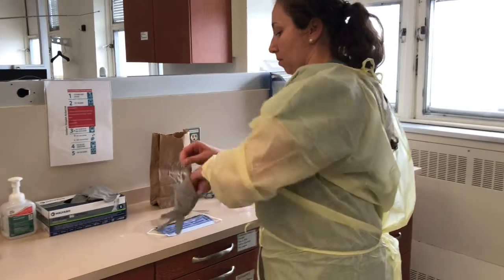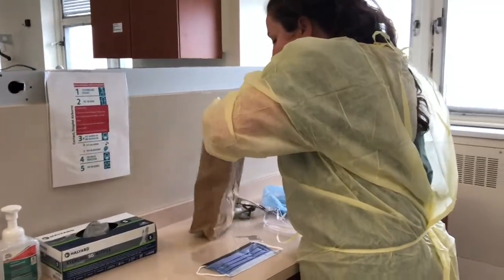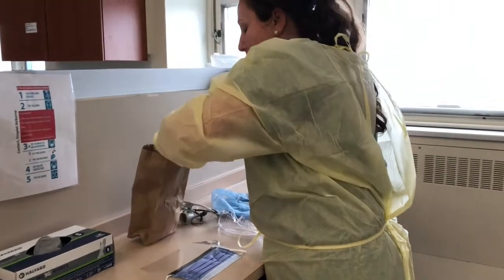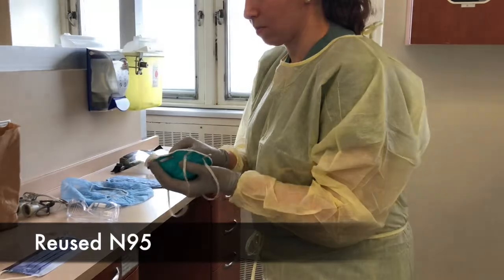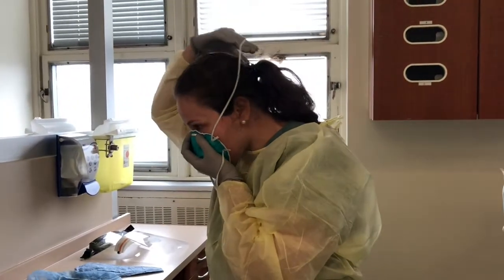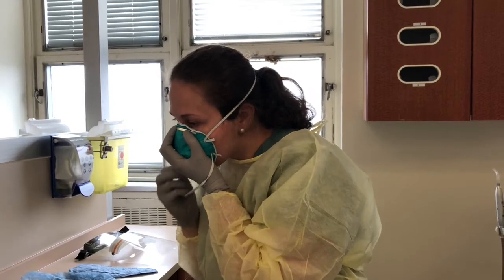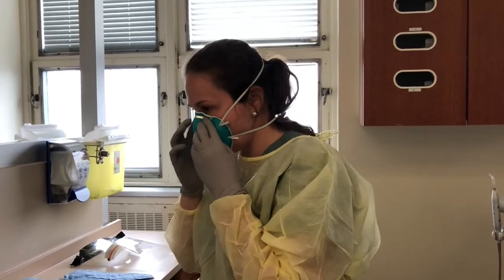Apply gloves and remove the N95 mask from its storage bag. Cup the mask with the nose piece up and both elastics hanging below your head. Fasten the upper elastic to the crown of your head, then apply the lower elastic to your neck, ensuring that it contacts bare skin only.